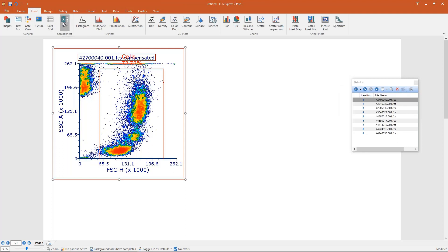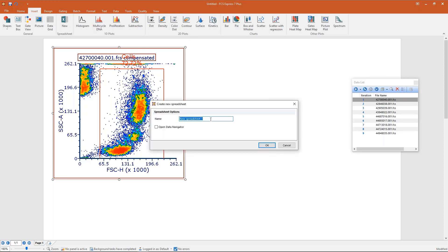To insert a spreadsheet in FCS Express, just go to the Insert tab and click on New Spreadsheet. A dialog appears allowing you to give a name to the spreadsheet you're creating — this is like the worksheet name in Excel. Let's call this 'my first spreadsheet.' There's also an option to open the Data Navigator, but I'll show you how to open that manually. Click OK and your spreadsheet appears.